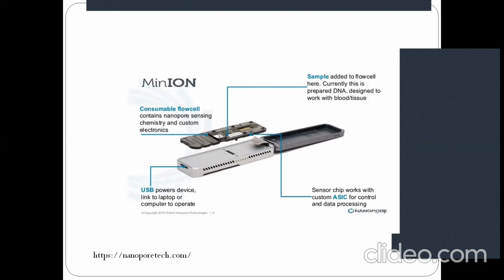Whatever data you have acquired or captured, the second step is called base calling. Now, what is base calling?